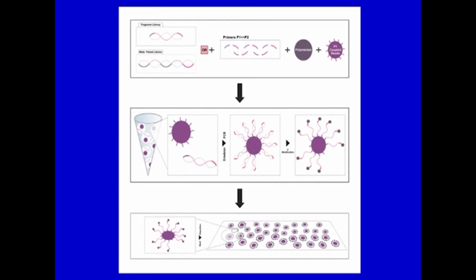The ABI chemistry utilizes sequencing by ligation. In this method, fluorescently labeled oligonucleotide probes are ligated to the primer only if they are perfectly matched to the upstream sequences. This ligated piece of DNA now serves as a primer, and the next labeled probe is ligated to this if it matches the upstream sequence. So, significantly higher specificity is obtained and higher accuracy also than the sequencing by synthesis approach. So, this is how this reaction is carried out.